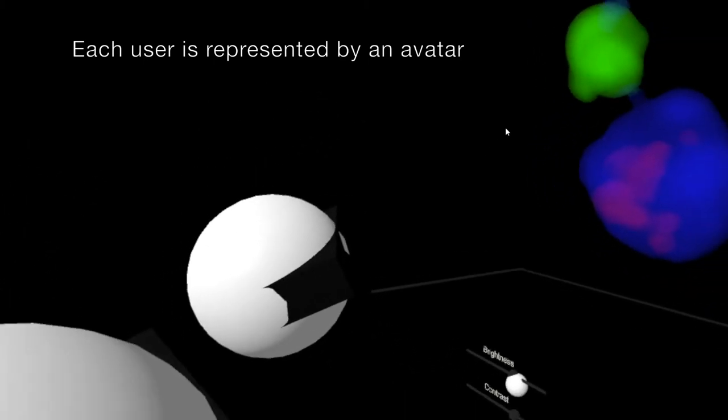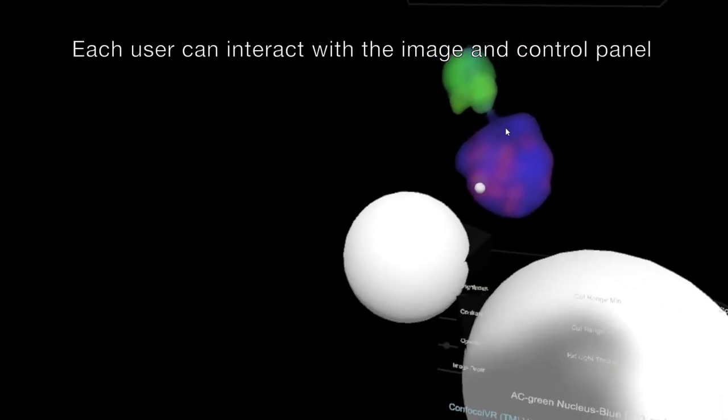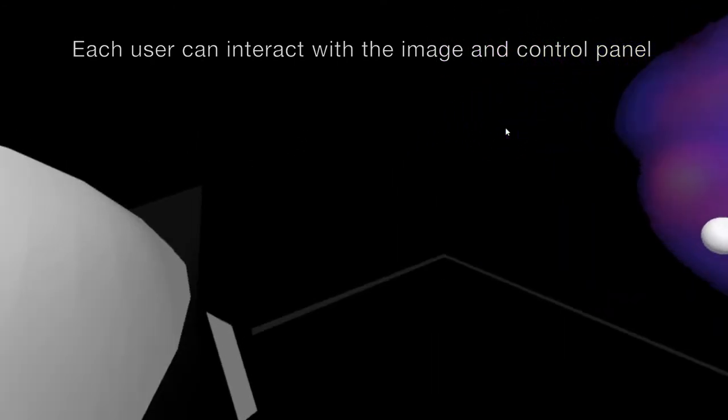You can see the green getting through here by transference. You can see the overlap, and it's inside it — yeah, it's inside.